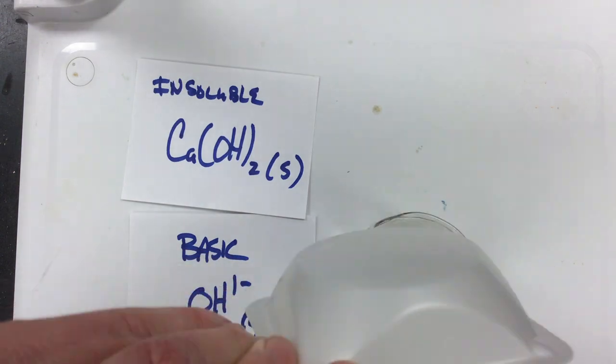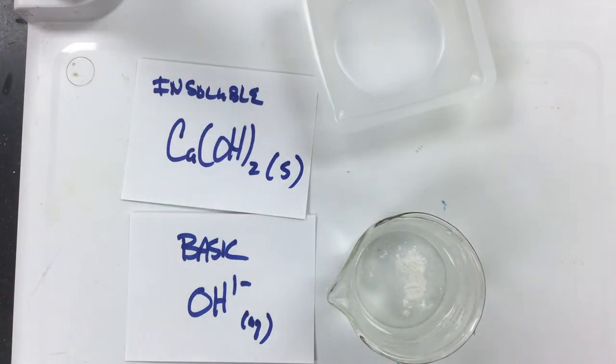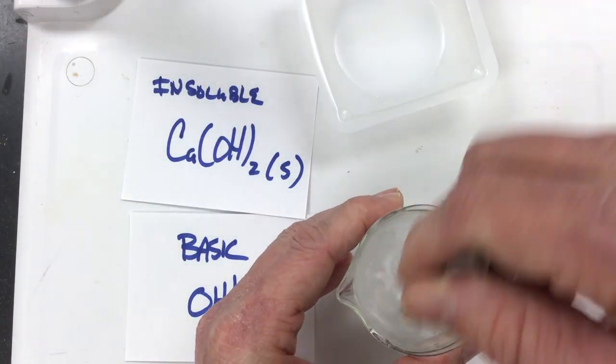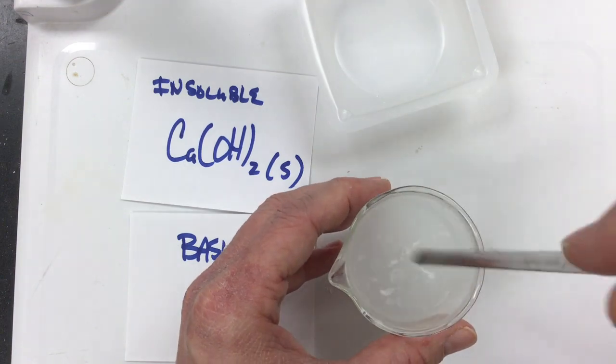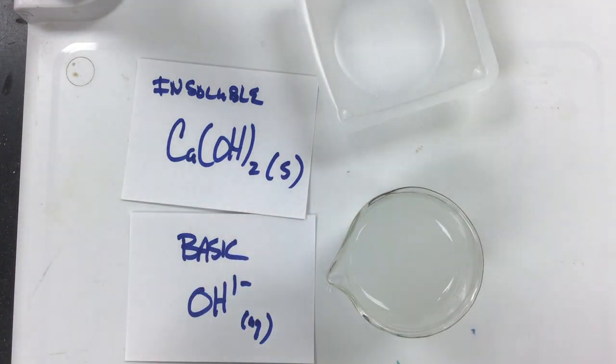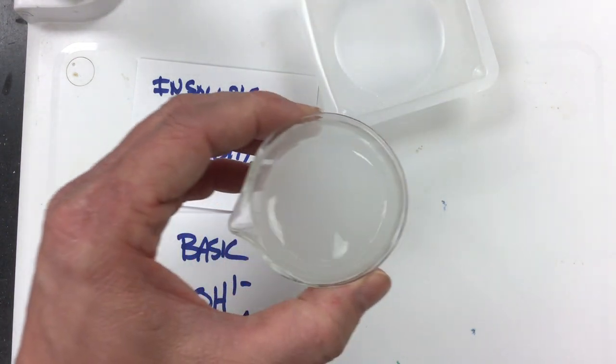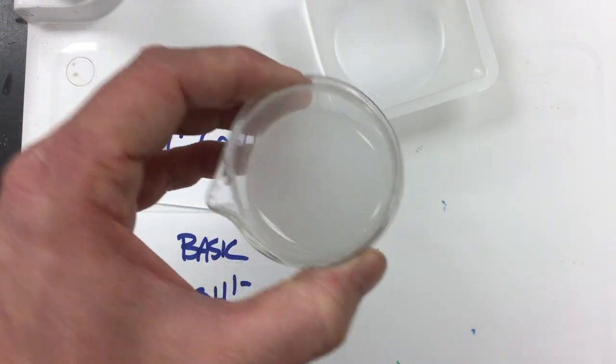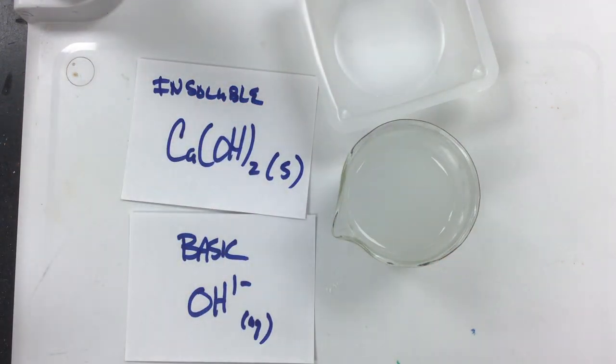I can prove to you that it's insoluble. If I take some of this white powder here and put it into some water and give it a stir, you can tell that this is a cloudy solution. If this was a clear solution then it would be soluble, but as it is it's tremendously cloudy and therefore it is not soluble.